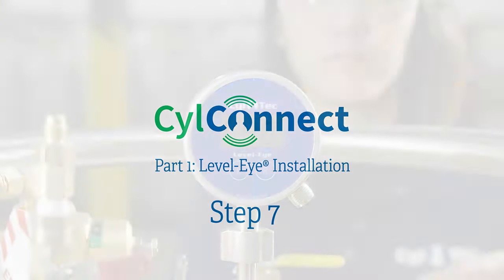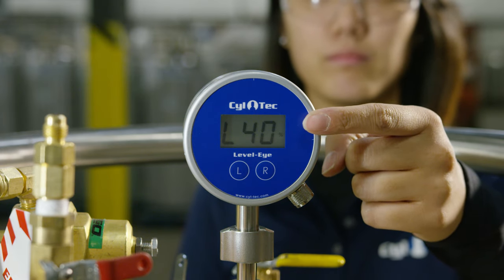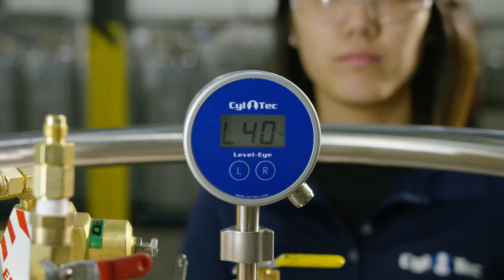Step seven: ensure that the no signal symbol is no longer displayed. The Level-Eye will not provide accurate readings until calibration is complete.